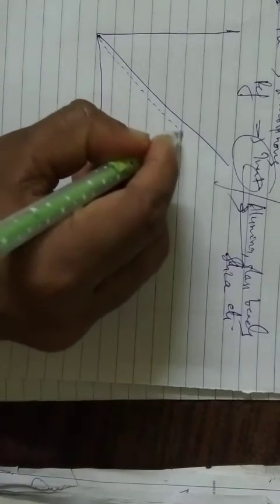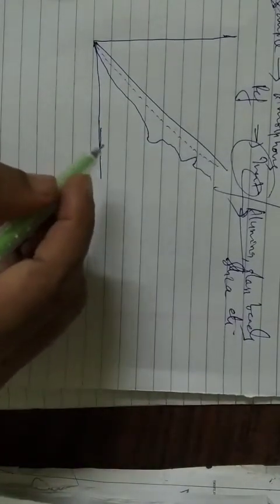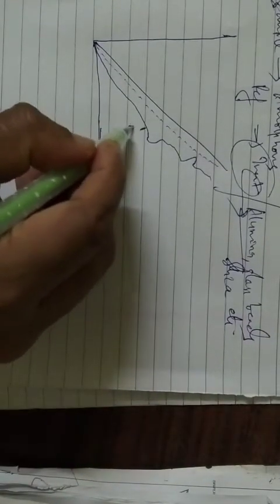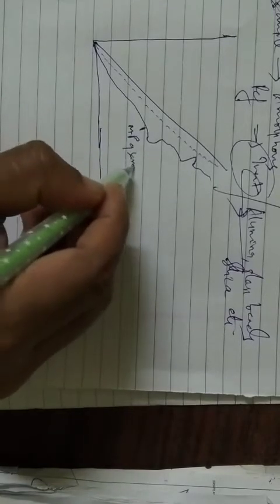And now if you see the graphical presentation of this DTA, we can show it in this way. I will take a line here, then a dotted line here. We will learn what this dotted line is, the reference. Slowly you can see it like this, and you can take this as the melting point of the sample.